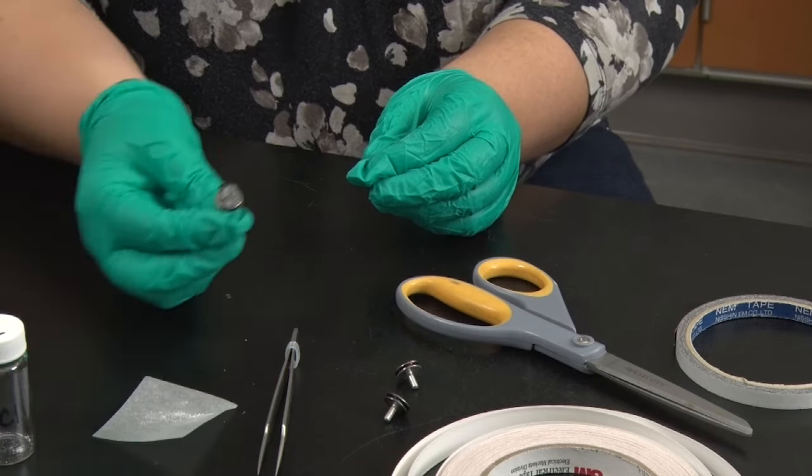The salt crystals become relatively dark because sodium and chlorine have lower atomic numbers than the metal sample holder that they are sitting in. This image is also much flatter looking than the secondary electron image.